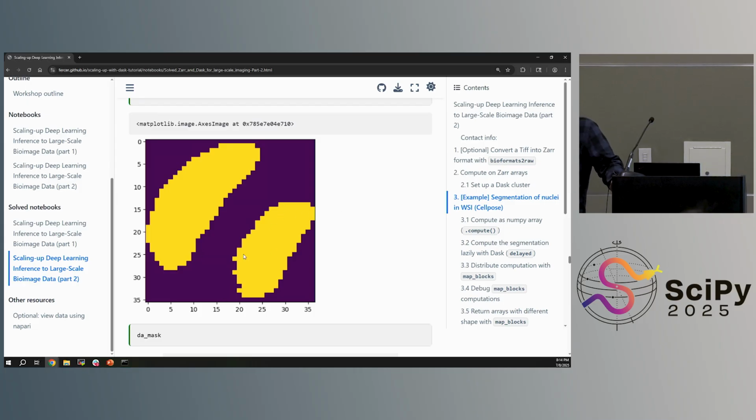So I would suggest maybe just skip that section, especially given time is already kind of limited. I think it will be more valuable to jump to the next part. But when I ran that locally, it worked. So it's only in the Napari one that, for whatever reason, it has trouble gathering these things. I don't know if maybe it's somehow using the GPU and then getting it back from the GPU. I don't know. Good catch.